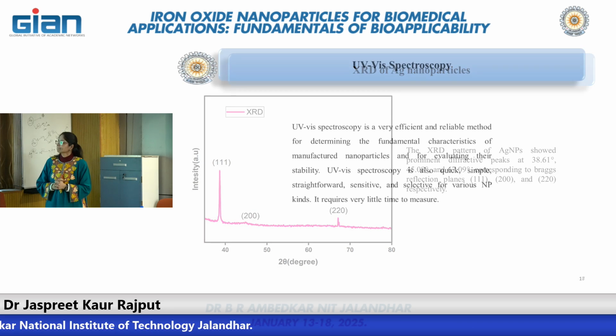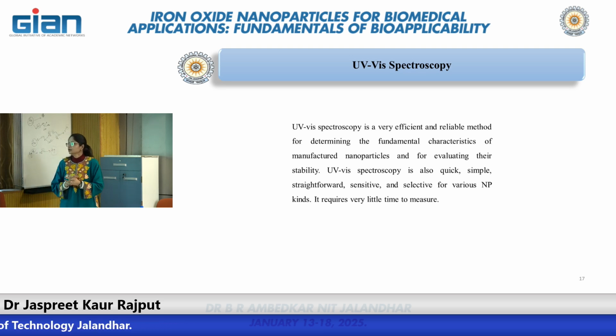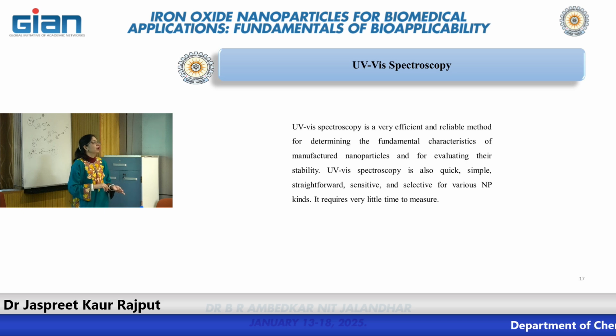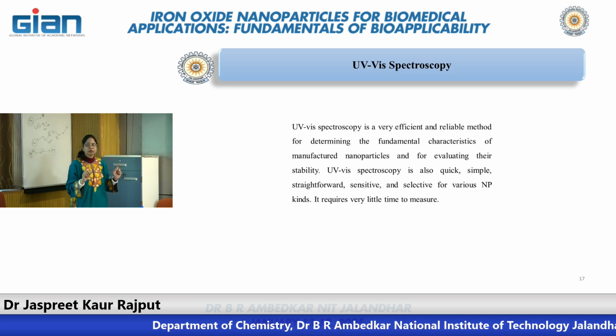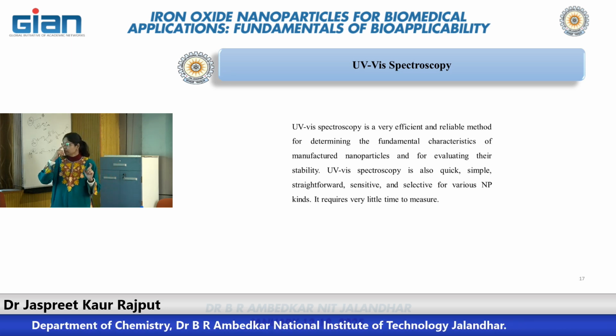Next. Okay, now UV visible spectroscopy. Today you will see the UV visible spectrophotometer, and you will analyze your synthesized silver and gold nanoparticles by UV spectroscopy. So now you can see next.